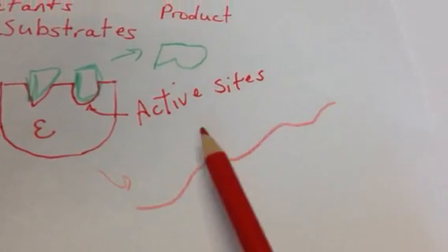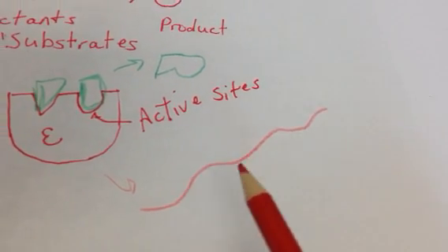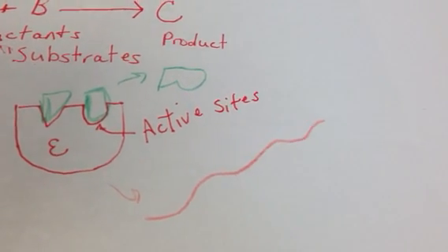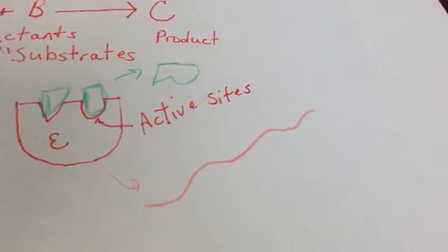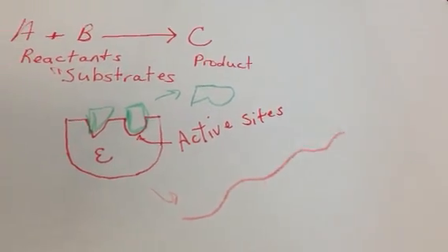So when you heat an enzyme, you denature it by breaking the chemical bonds. Denaturing it means that you change the shape and you destroy the enzyme. In other words, you render it inactive. It will no longer work. Drastically changing the pH of the solution will also do that, but we didn't look at that in lab. We just looked at adding heat. So those are the results you should have had with that one.